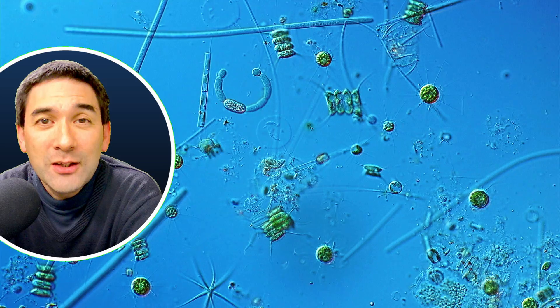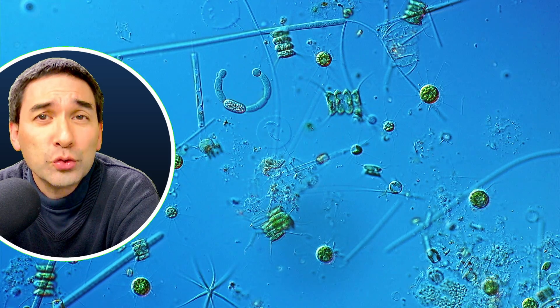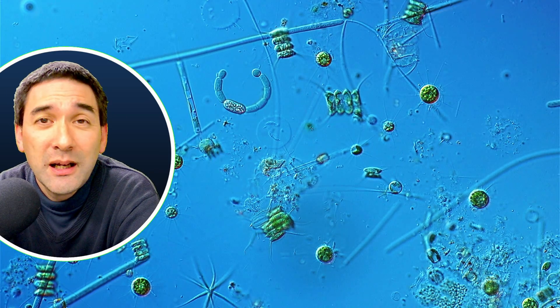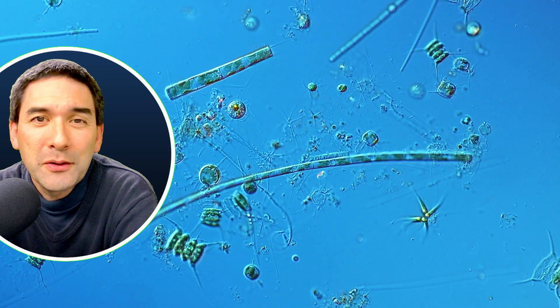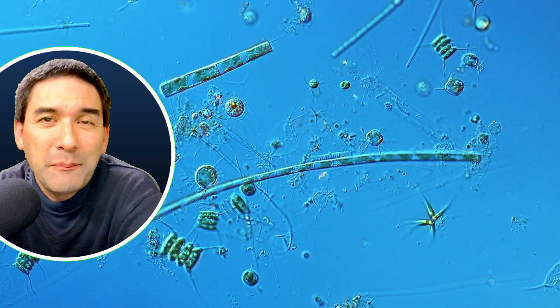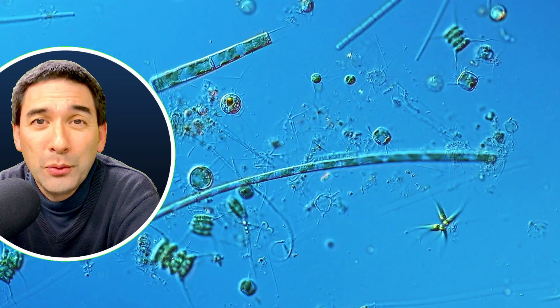Of course, plenty of algae and other unidentifiable material here. And quite nice — those long rod-shaped structures — these are cyanobacteria. And this was now a little bit in time-lapse, so it was speeding up a little bit to be able to see the movement better. And here again, an assortment of different algae and other microorganisms that I was able to find in the pond water sample.